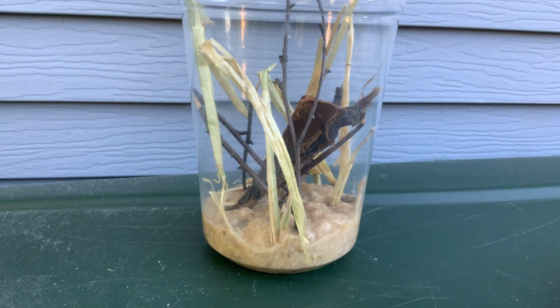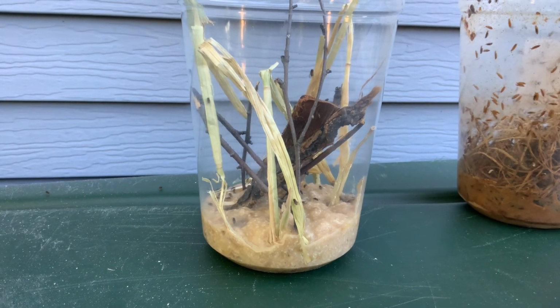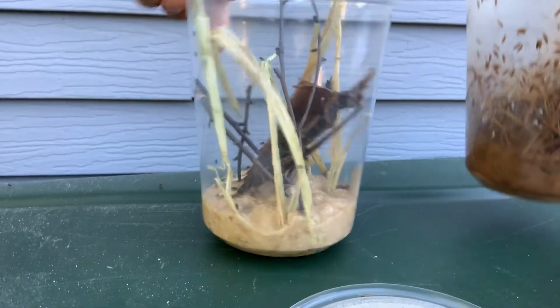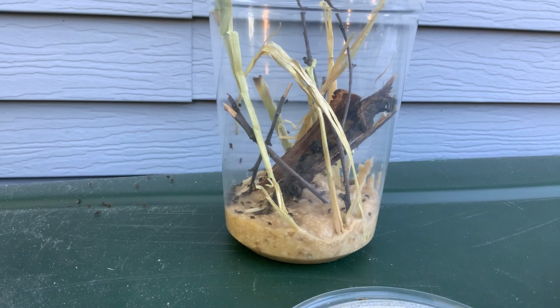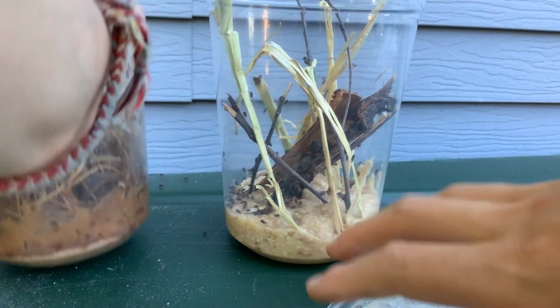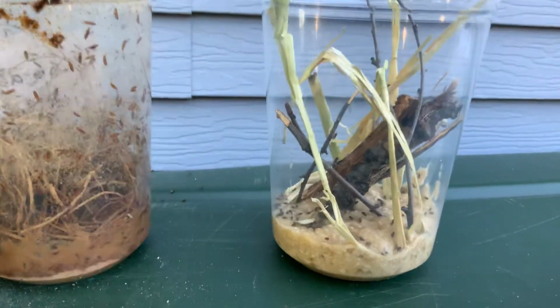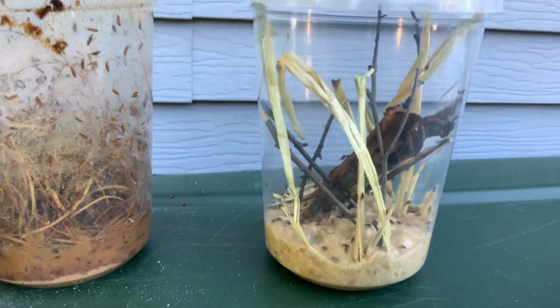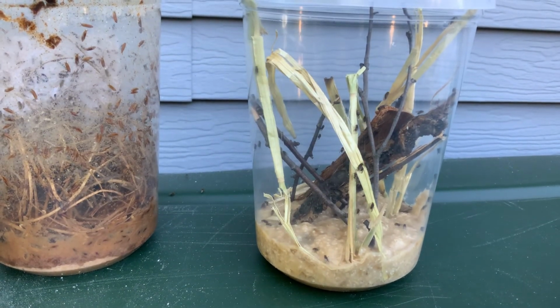And then you just tap them in. It can be like 15 to 30 to maybe even 100 to start a culture. I just put in a whole bunch to produce a whole bunch of flies. Maybe even a couple more. Oh, need to tap that down now. Actually, this is the first time I've done this, so I'm going to see how it works out. And I'll give you results later. But just tap that down and then close that. Done. That's simple. Make a fly culture, I guess.